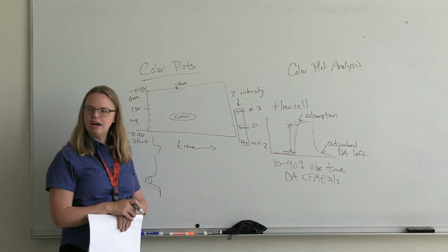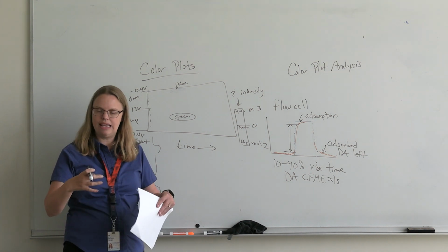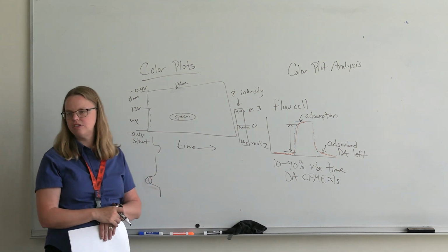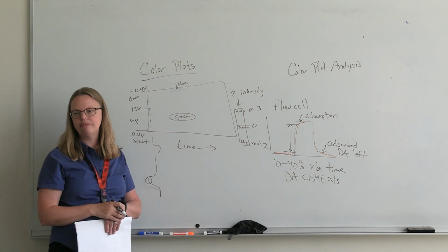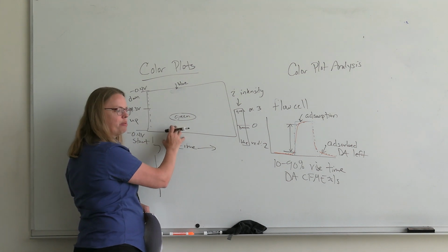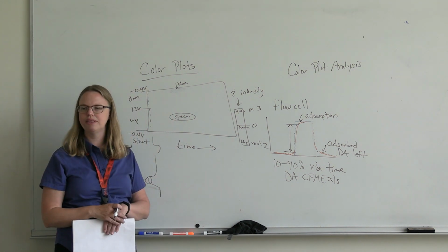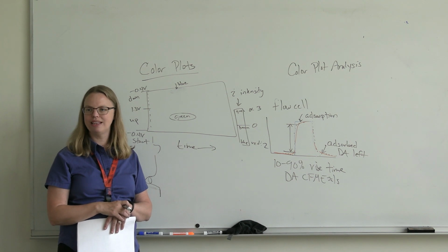There are some idiosyncrasies of color plots, and it's like looking at an image, looking at all the data. We think that using color plots will be able to tell things apart better than just using a simple CV at one given point in time, or a simple I versus T at one point in time. FSCV people love their color plots because you can look at all the data. We often simplify it to line plots if we just want to talk about what's happening at one point in the brain, and then we study CVs to really learn the fundamentals, which is why that's where I started.